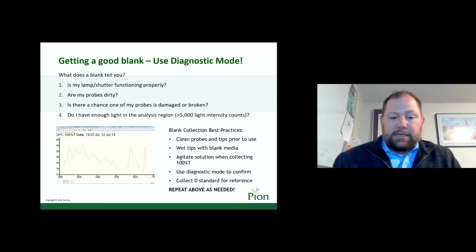Some best practices to consider when working with 100% T in diagnostic mode are listed on this slide. Each of them enable the collection of a good blank and test the collected 100% T in diagnostic mode. Please keep in mind that diagnostic mode scans are not saved, so it is recommended that you collect the blank media as a standard with concentration equal to 0, which will save the blank absorbance spectra in the file for investigations or confirmations at a later time.